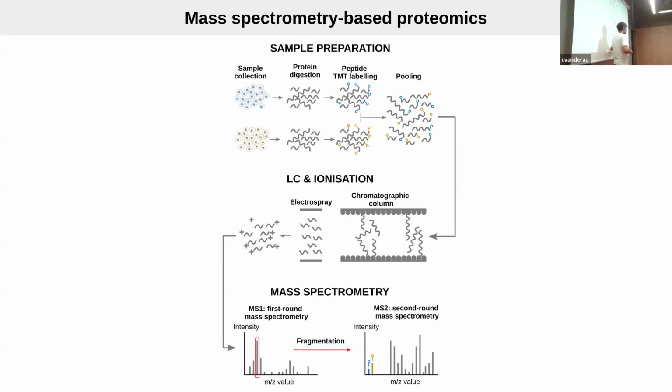If we look at this range, the profile of these precursors will give you an idea of what the identity is. And then from the spectrum, we can assign a peptide identity. We have then a peptide spectrum match.